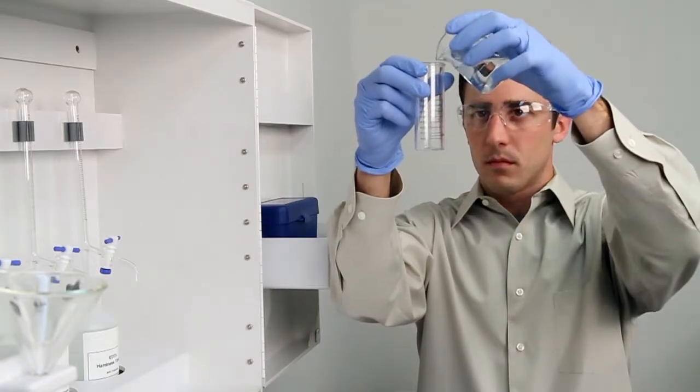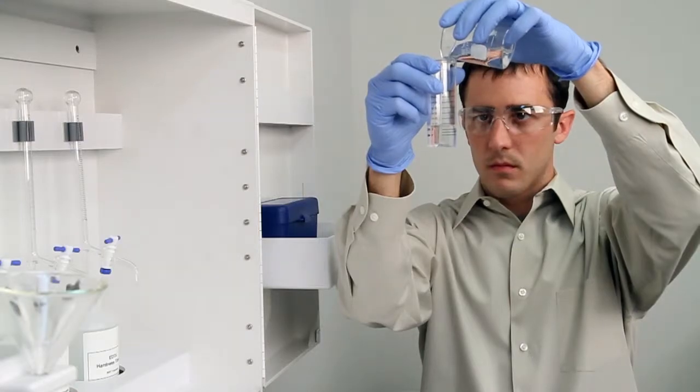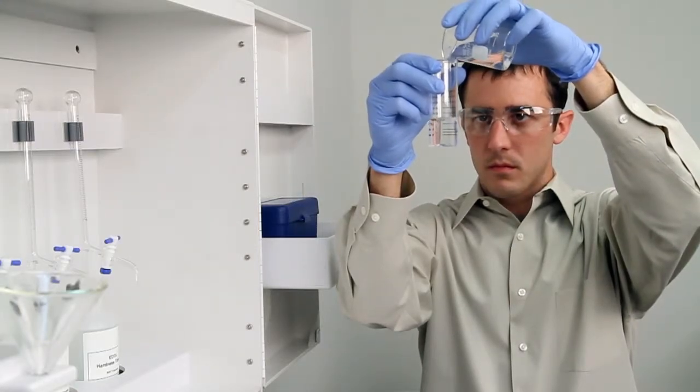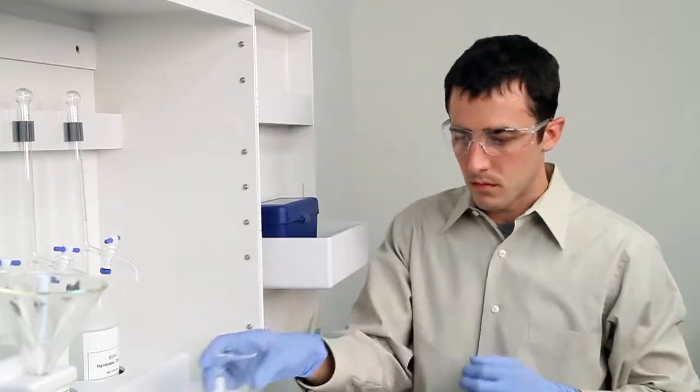To get an accurate sample, hold the vial close to eye level. Accuracy is very important during this step. Once you feel you have an accurate sample, place the vial on a level surface and bend down to eye level to verify.